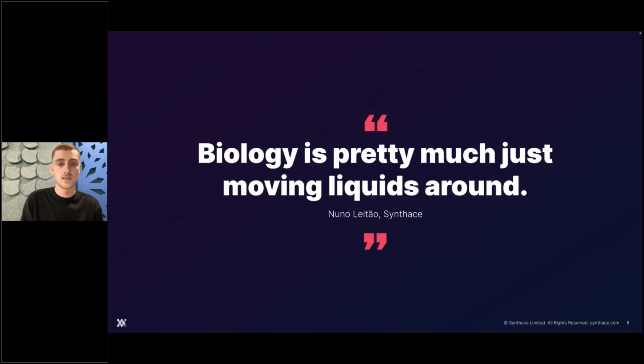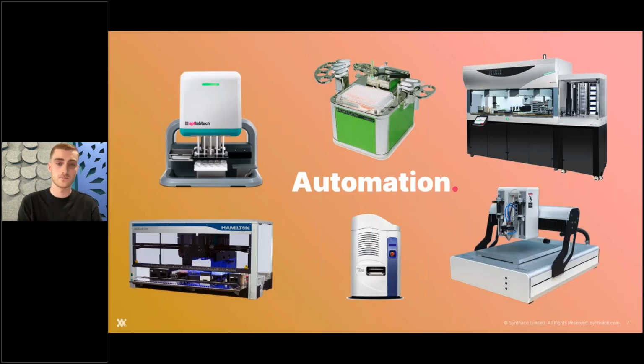What I mean by this is, we adjust how we handle different liquids without thinking about it. So if a liquid needs mixing, we give it a mix. If a liquid is viscous, we chop off the tip. And if a liquid foams, we reverse pipette it. And we do this on pure instinct and experience.